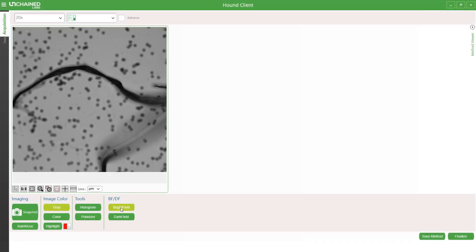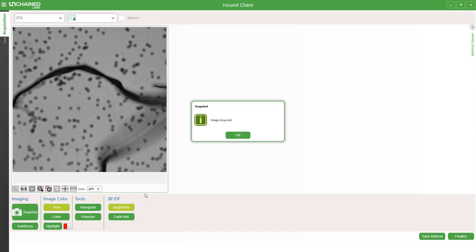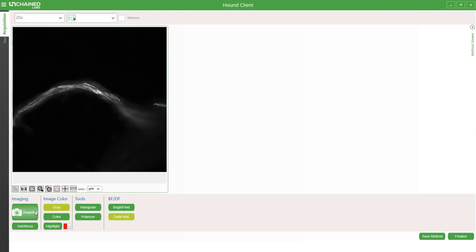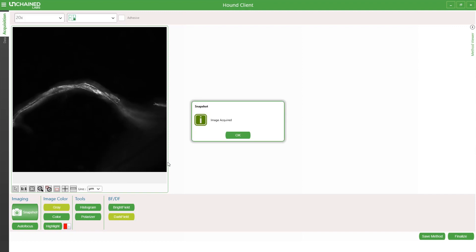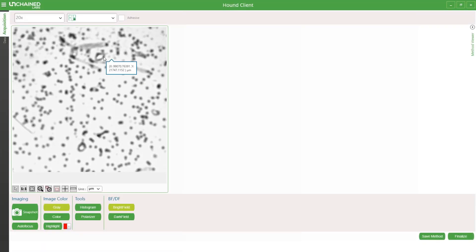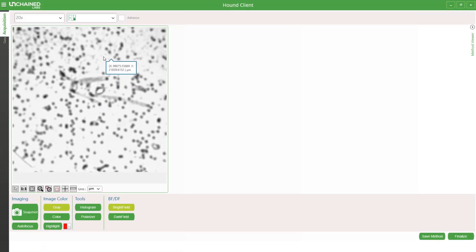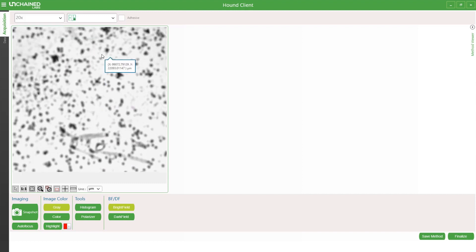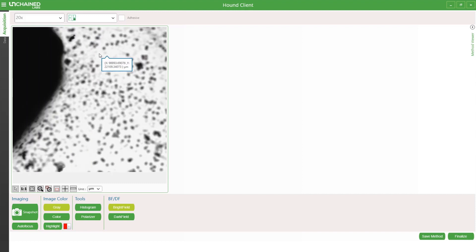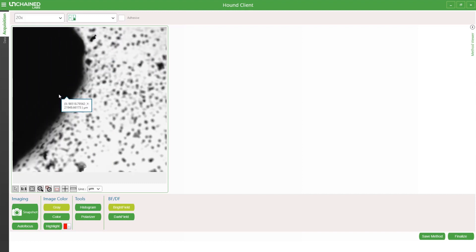With the built-in camera, I'm going to take a few images of the particle in both bright field and dark field mode. In the case of my first particle, I'm going to use some intuition that the sheen I saw in the vial makes it more likely to be a metal particle.